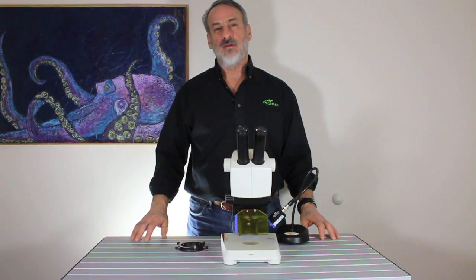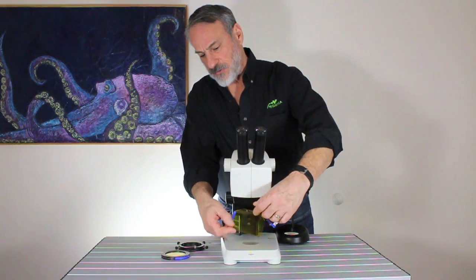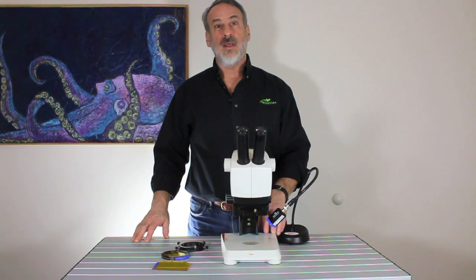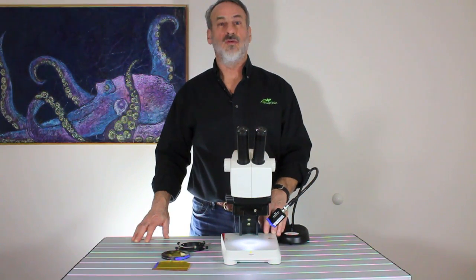The adapter does not interfere with any of the built-in functions of the EZ4, so you don't have to remove it for white light work. Just remove the barrier filter and the shield, and you can leave the adapter in place. The large elliptical cutout in the EZ4 adapter even allows the built-in top lights to do their job.